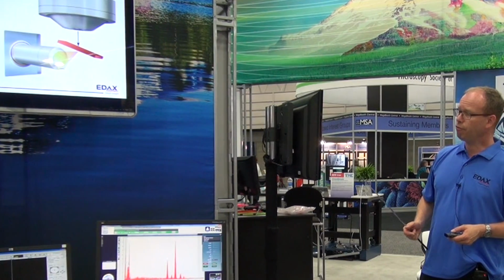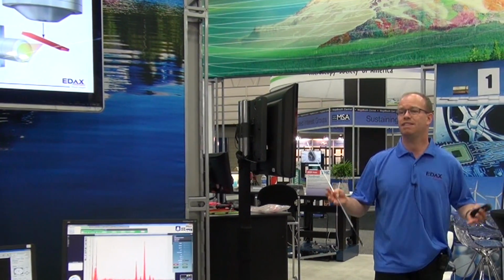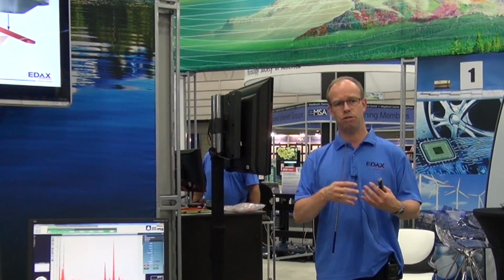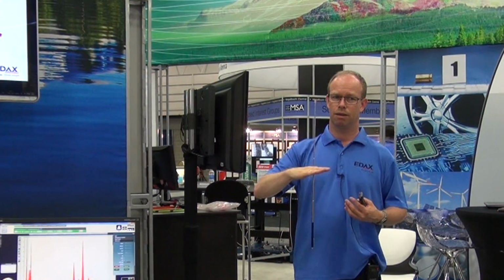The sample itself can be tricky. It's a specimen preparation, let's say a normal TEM preparation. But the thing to keep in mind is most TEMs operate at 80 to 300 kilovolts. That means the penetration power of these high energy beams is pretty high. In the SEM we cannot go higher than 30.